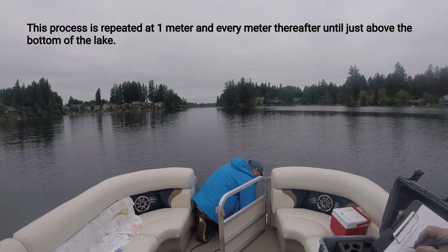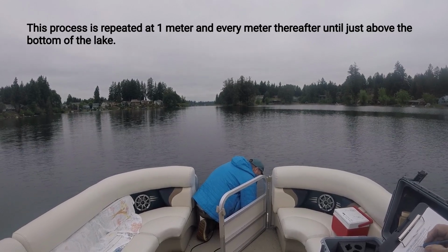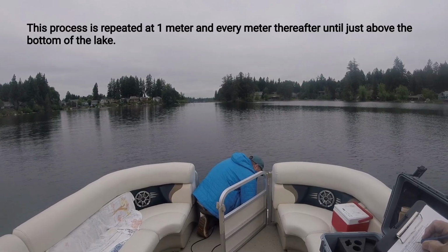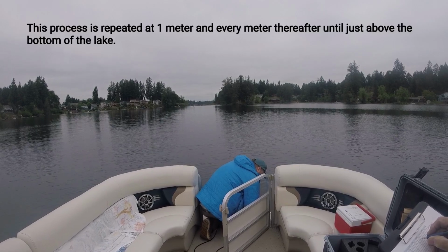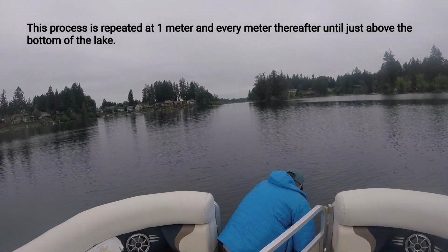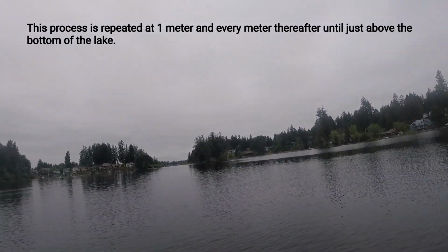Temp is 22.6. DO is 110. Conductivity is 139.1. pH is 7.61.